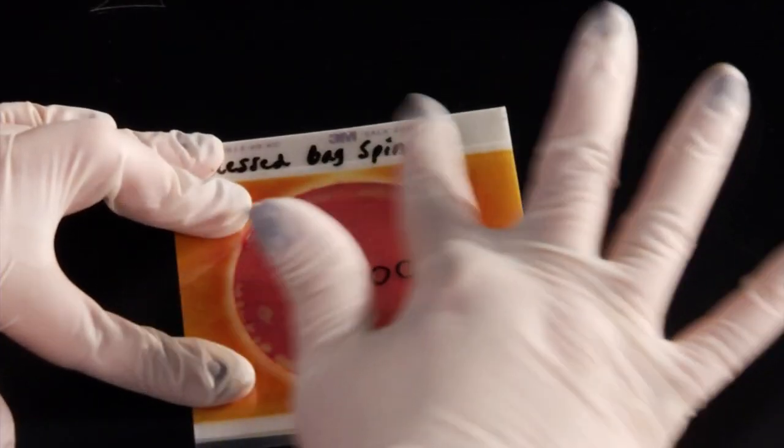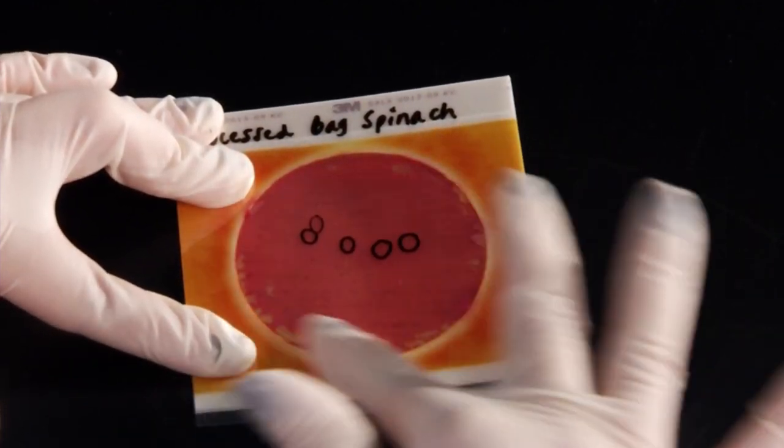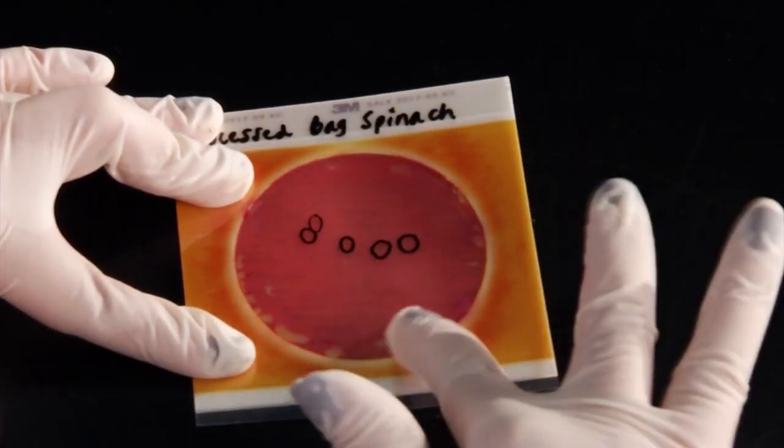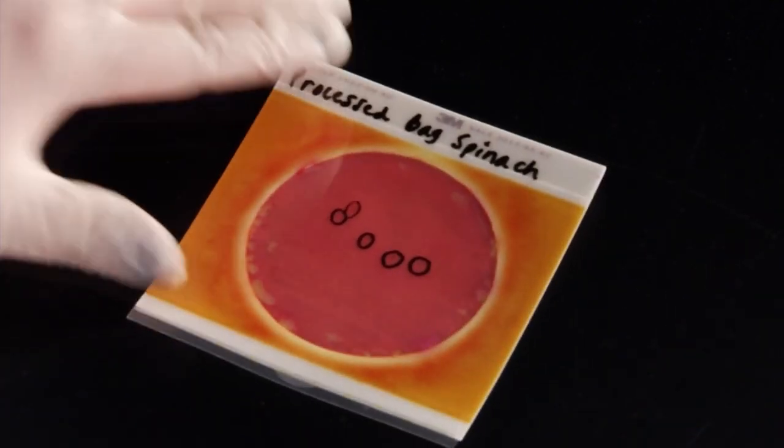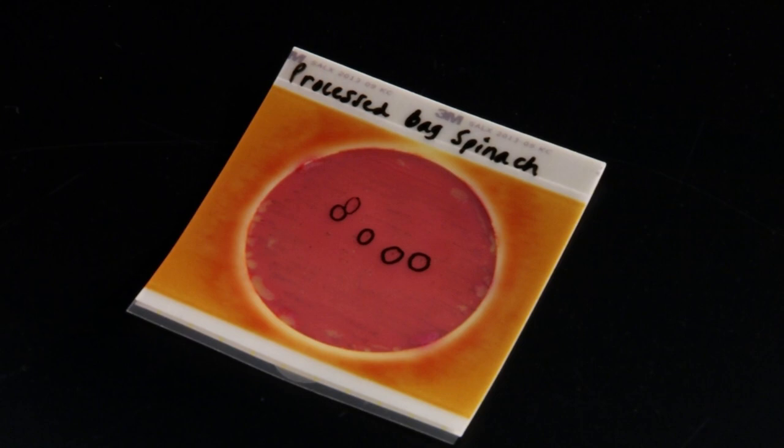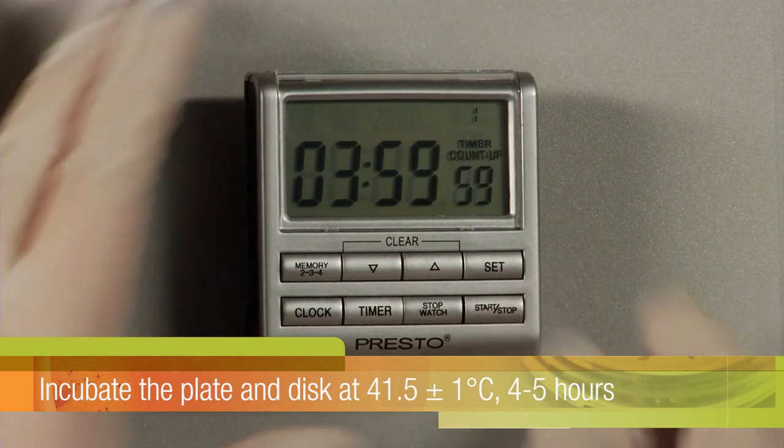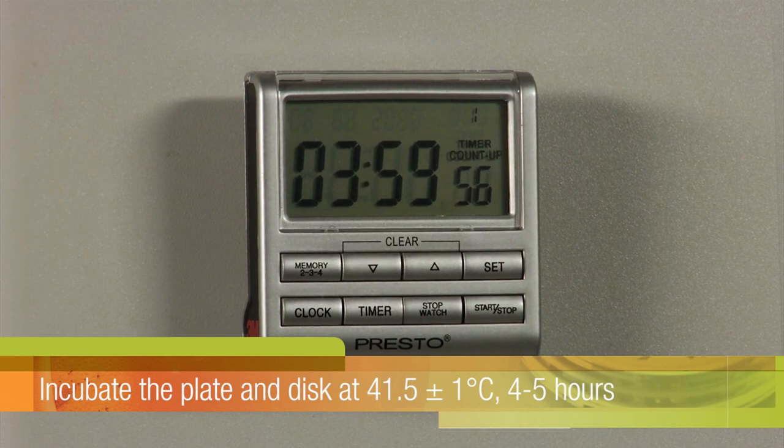Next, gently apply a sweeping motion with even pressure across the top film in order to remove any air bubbles in the inoculation area and assure good contact between the plate's gel surface and the 3M PetriFilm Salmonella Express Confirmation Disc. Incubate the plate and disc at 41.5 plus or minus 1 degree Celsius for 4 to 5 hours.